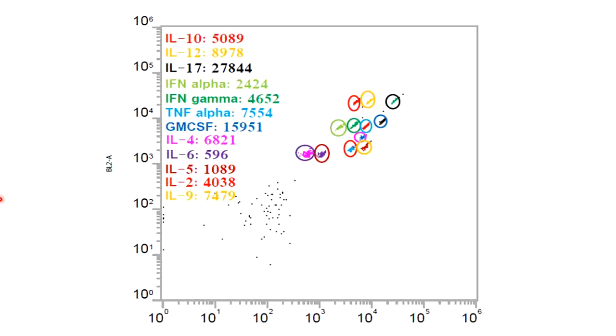But for that we will require what? 2 ELISA kits. If you want to measure a third cytokine, 3 ELISA kits; 4 cytokines, 4 ELISA kits; 5 cytokines, 5 ELISA kits. And ELISA will take 10 days to do optimization and all. Imagine you want to measure 50 cytokines. For that you will require 50 ELISA kits. Very expensive, very time taking.